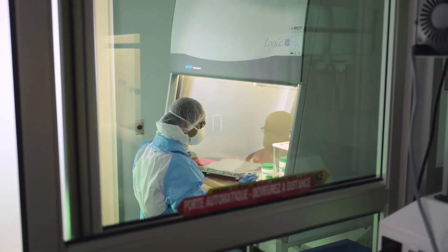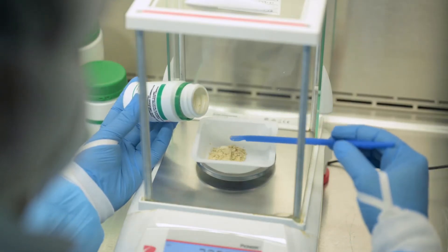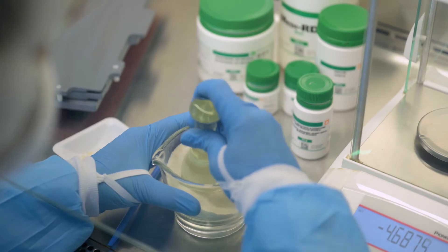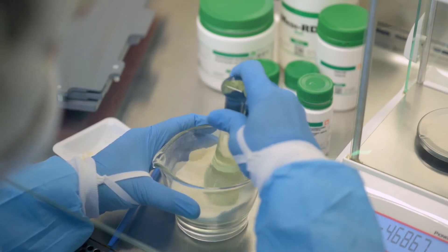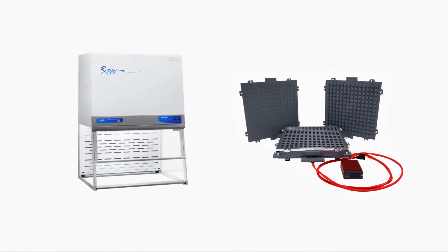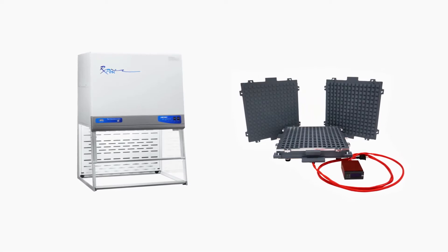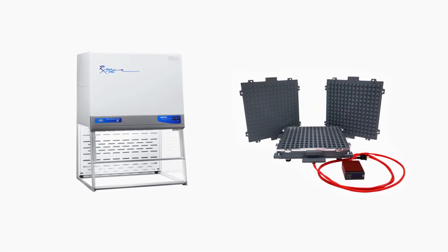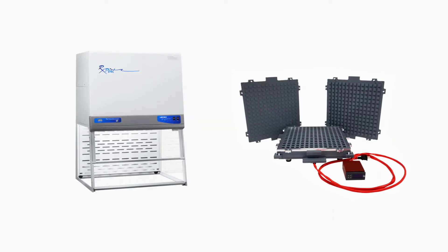First things first, weigh and blend your powders into a homogeneous mix. If you are working with hazardous drugs, the Medi-X-Tab system can be used inside an appropriate size hood creating a contained space during the compounding process. This innovative safety feature is ideal for hazardous drug compounding.